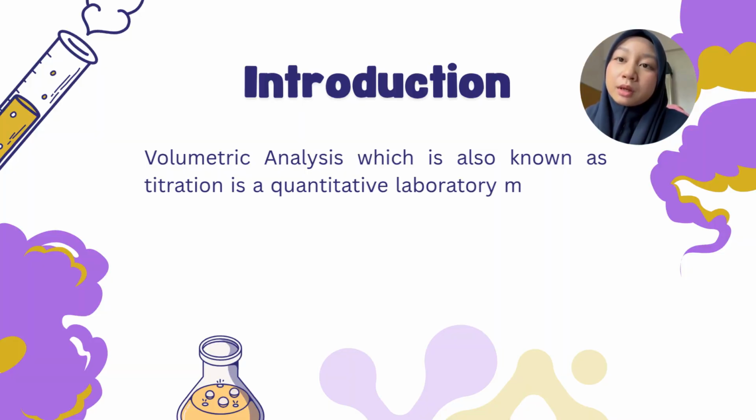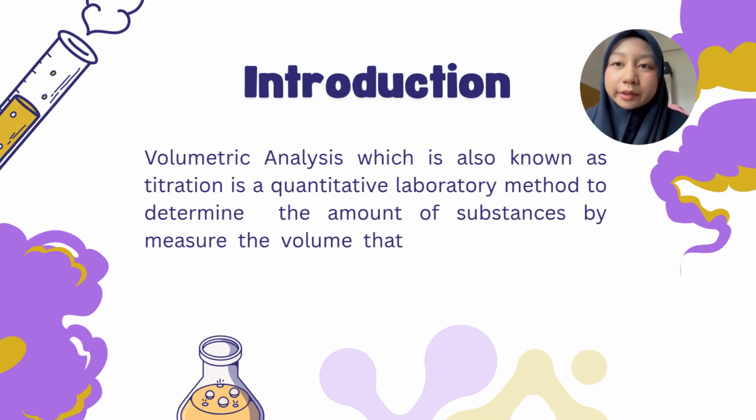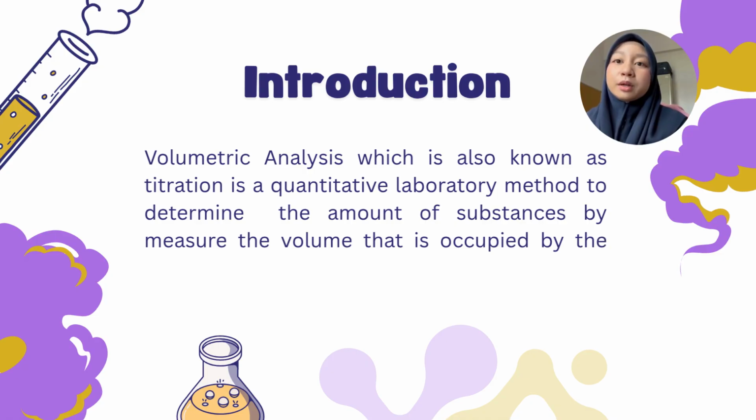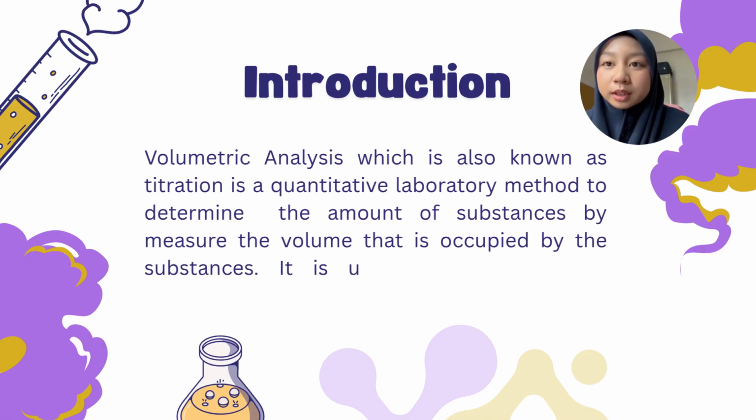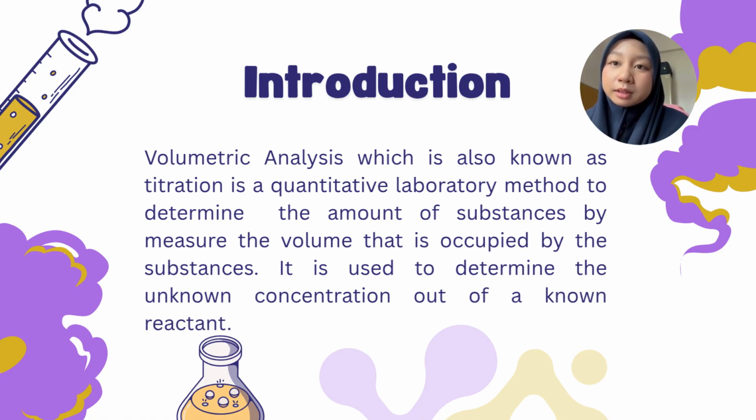First and foremost, volumetric analysis is a laboratory method, also known as titration, where you adjust a laboratory instrument called a burette until you achieve a specific measurement, reaction, or balance in a solution. The aim of this method is to determine the unknown concentration from a known reactant.